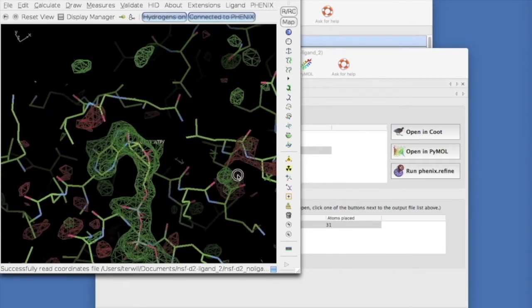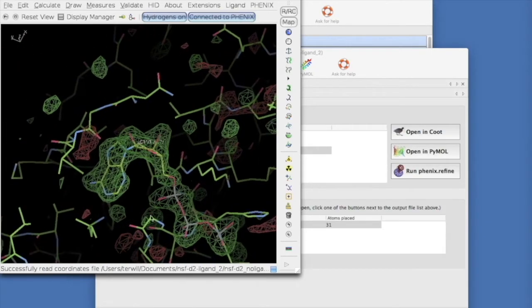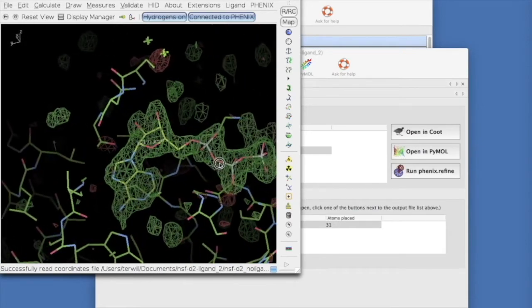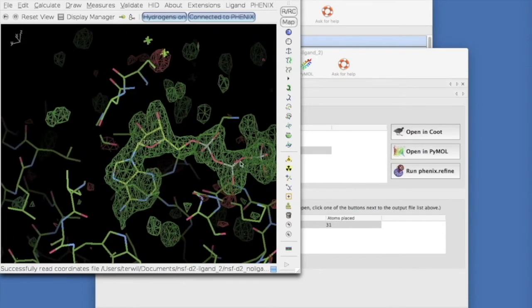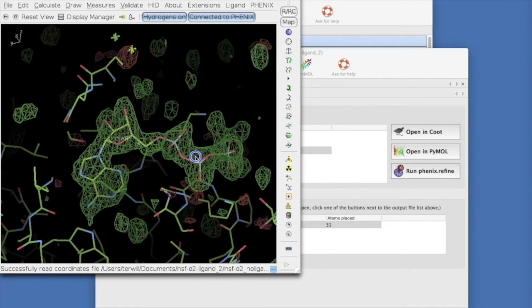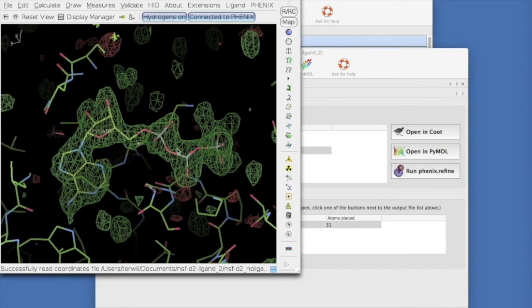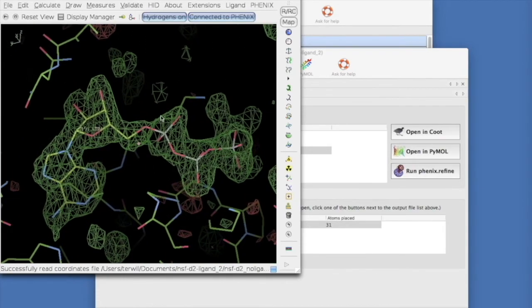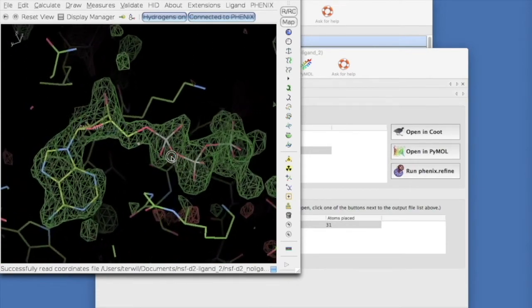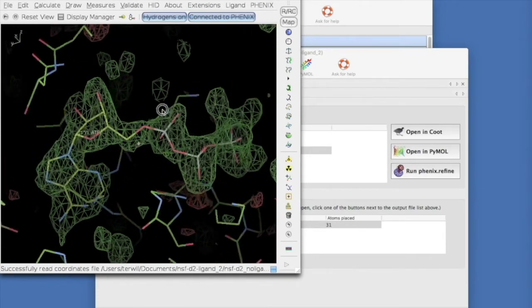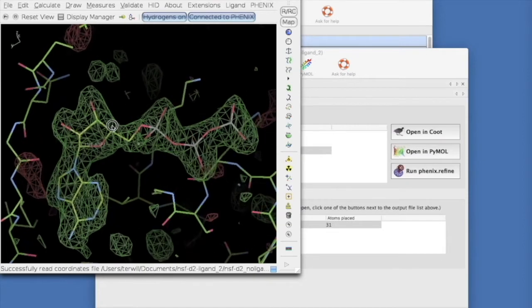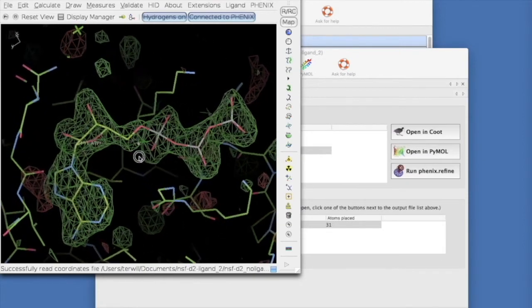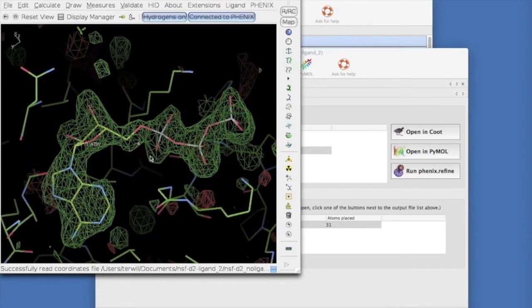This is the kind of result you might expect to obtain with data that are about 2 angstroms or so in resolution. As we saw in the introduction, at lower resolution, the density is more like a blob and is difficult to interpret precisely, while at higher resolution, even more detail than this is visible.